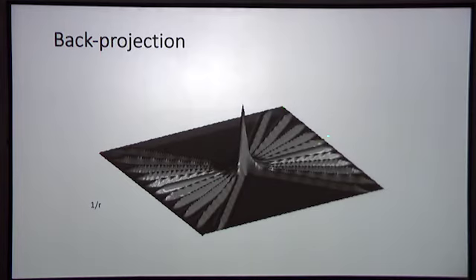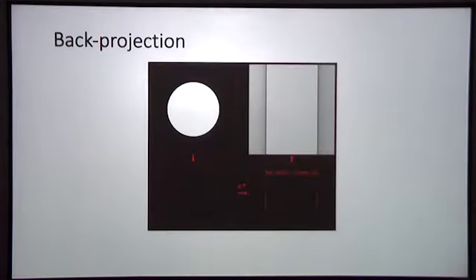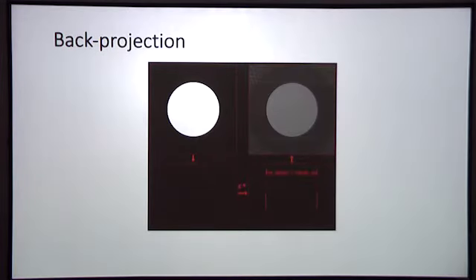That's because what I'm showing you here is a very simple back projection. If you now imagine what's happening in Fourier space, we're effectively adding up planes in Fourier space, but where they overlap, we're massively over-representing our objects. So we apply a weighting which deals with that. That's typically R weighting. So now we generate our projection, we weight it, and we back project the weighted projection. And if we now do this with a large number of images, we end up with something that looks much more like the object we put in.